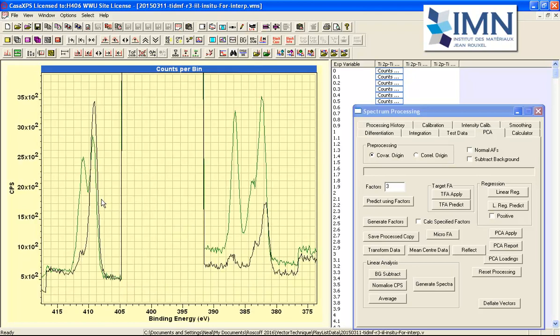So a further example would be to look at the oxygen. So we've got a peak here that looks like it's the oxygen 1s, and it seems to be correlated nicely with a large carbon peak bonded to oxygen, and you can clearly see that the shape of the carbon 1s spectrum is very different from anything that we saw in the original data set.